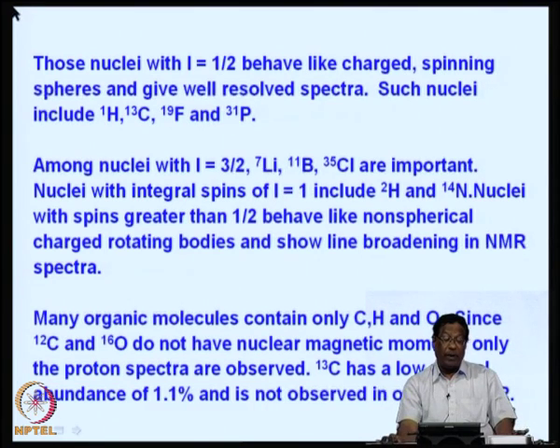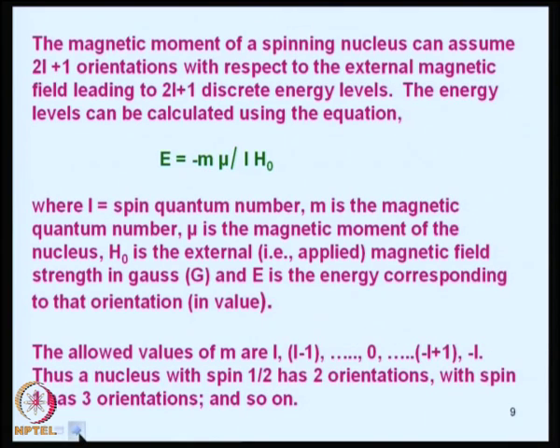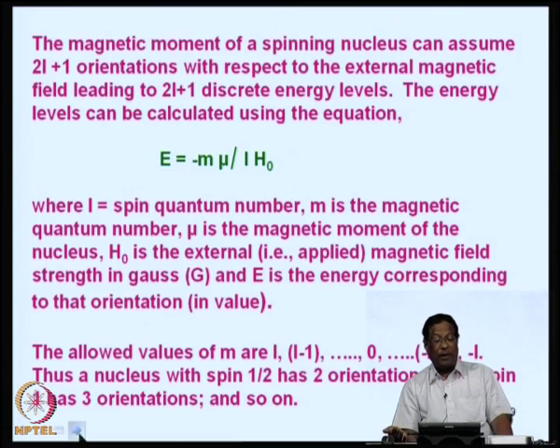That means it is not observed in ordinary NMR. So, most of the NMR work is related to proton NMR.